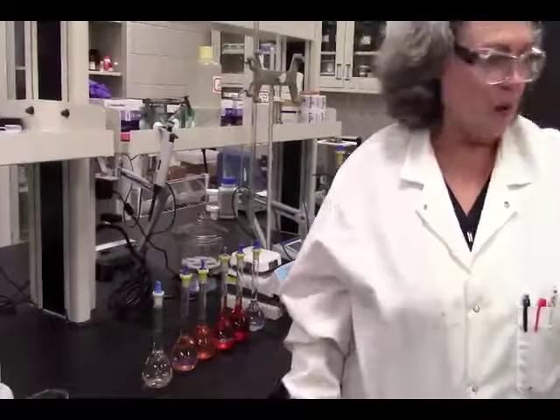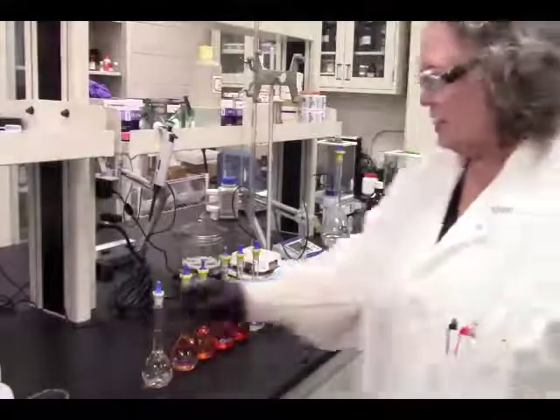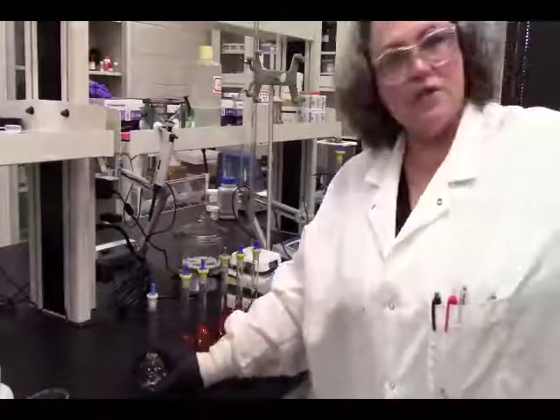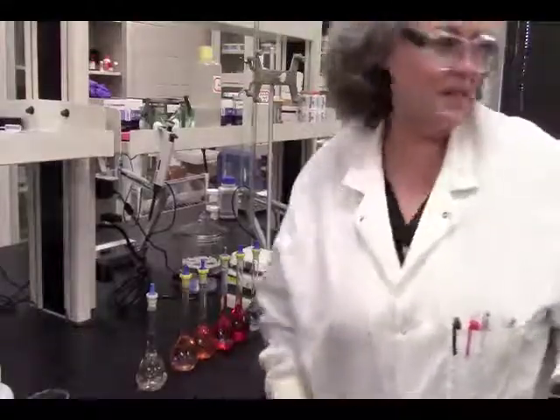Okay. Our samples had to set for 10 minutes. The timer just went off for our 10 minutes for our unknowns. This will still need to set for 10 minutes, but by the time we get to our UV-Vis and have it all set up, should be done. So we're going to set another timer and we'll see you back at the UV-Vis.